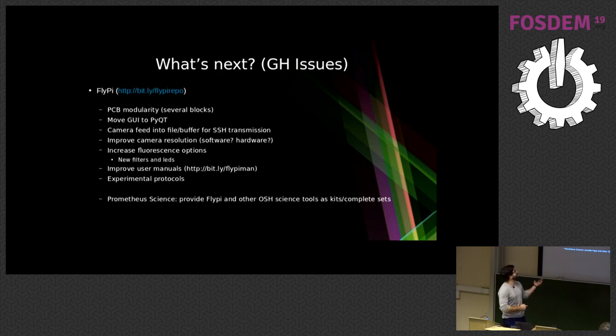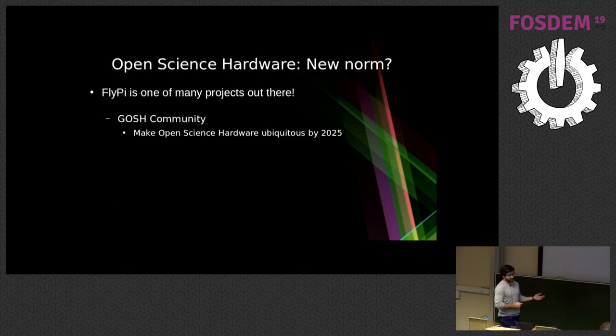And now for the last part of this talk, basically, sorry, did I skip something? No, this is correct. The FlyPi is but one of many, many projects available out there, and we're going to see this in a bit.